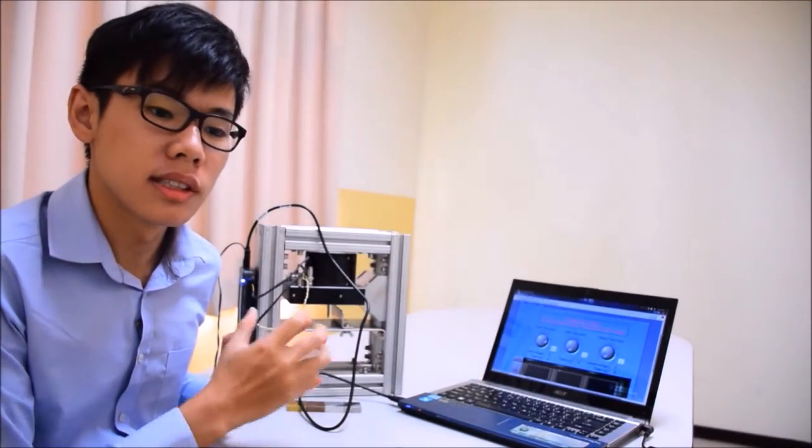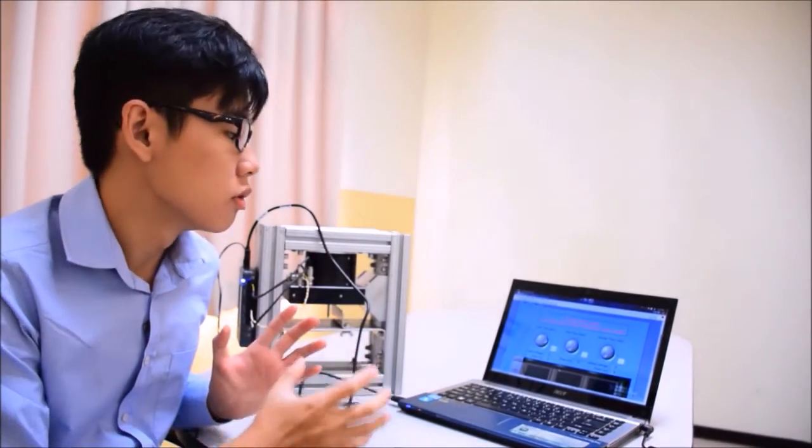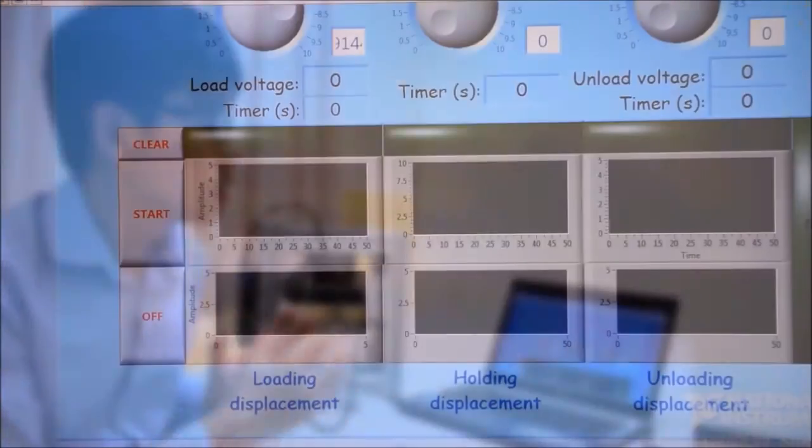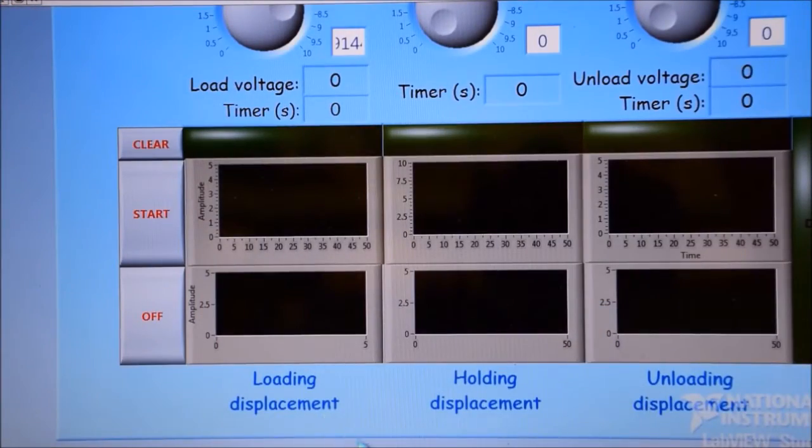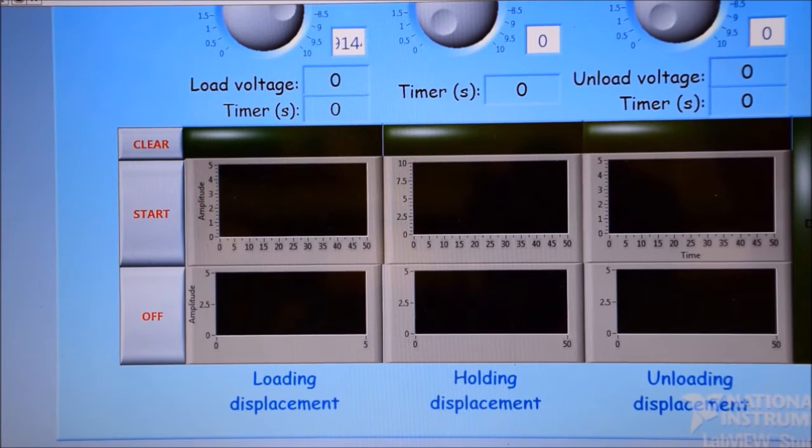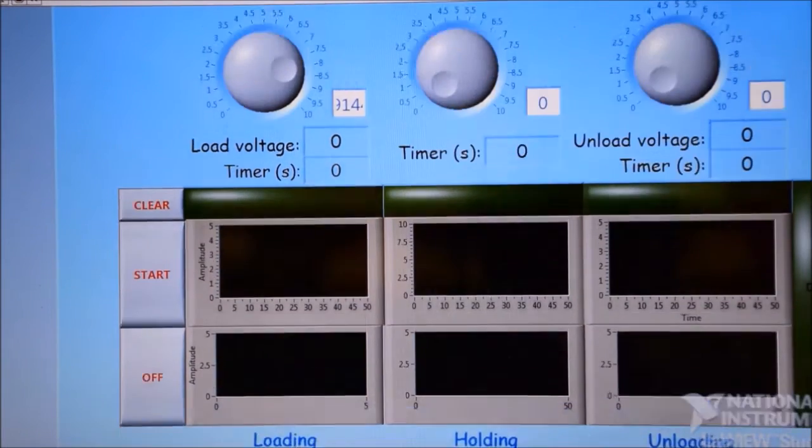Once you enter the nano-indentation system software, you'll be able to see a loading profile settings and displacement sensor reading.